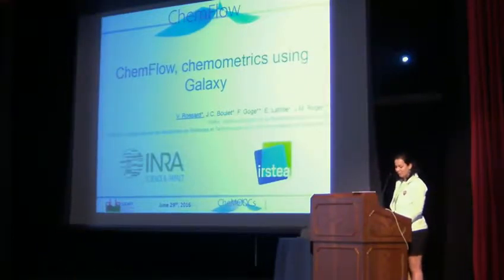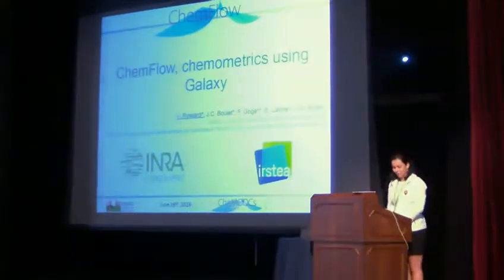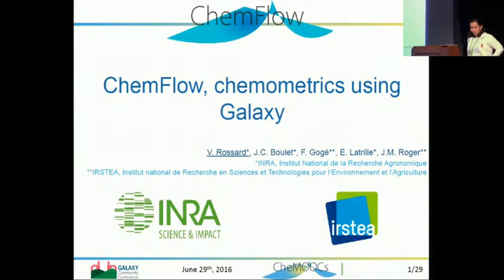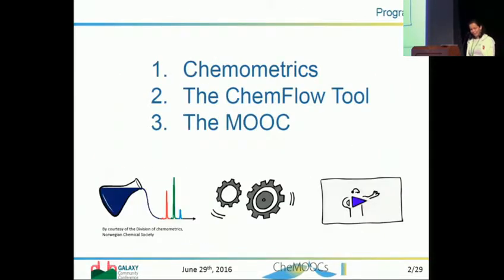I'm from the French National Institute for Agricultural Research. I'm going to present you a chemometrics project massively using Galaxy named Chemflow. All that we will see here is part of a MOOC project.